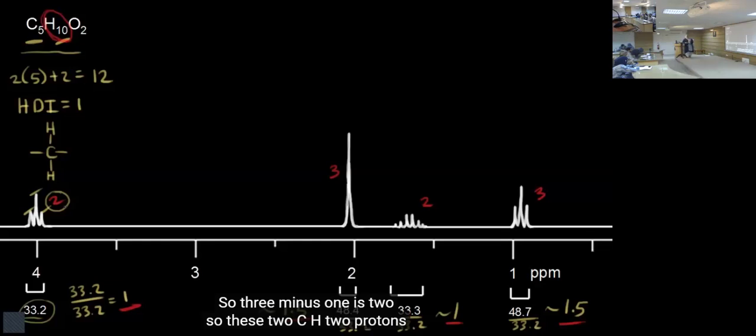Okay, and what about the signal around 1.6 ppm? It's 2 protons. Okay. So, okay, we will discuss this later at the end. First, go to the proton at 1 ppm. These are 3 protons, 2 neighbors.